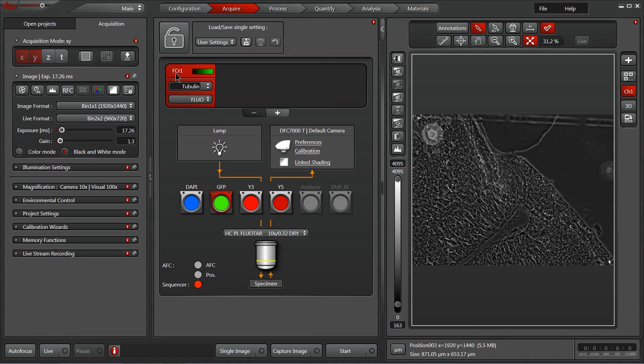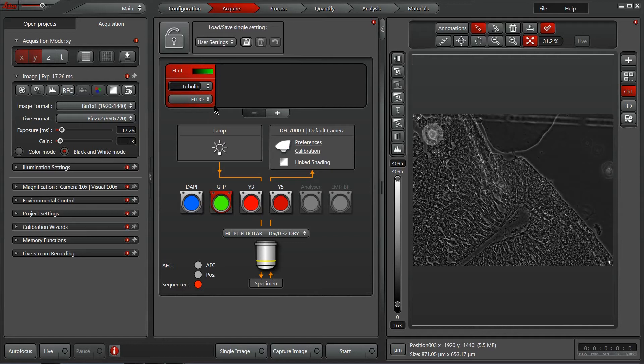Great! So now I have one channel setup, pseudo-colored in green, assigned to our GFP cube, labeled it tubulin, and actually utilized our Lexifluor 488 to show the software exactly what's going on with the wavelengths of light.